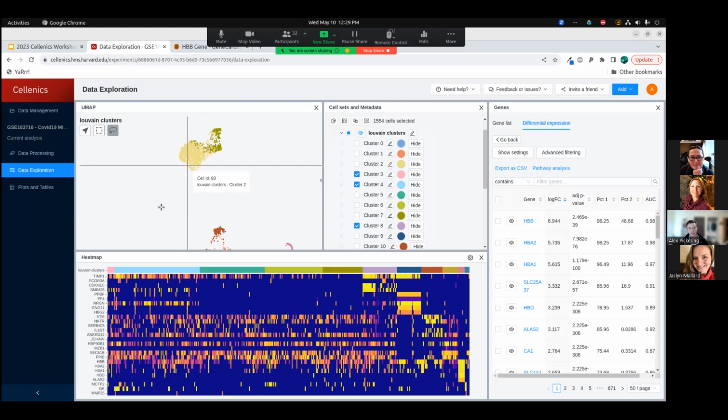I think as Peter mentioned, there is no one correct clustering. You can change the resolution of your clustering. You can get a ton of clusters for your data set. It's more of a heuristic based thing at this moment. But yeah, great question.